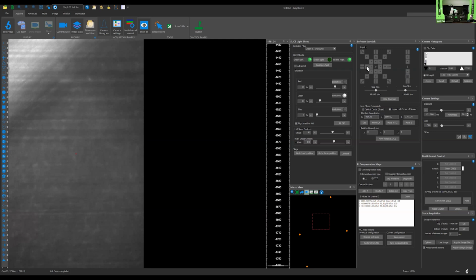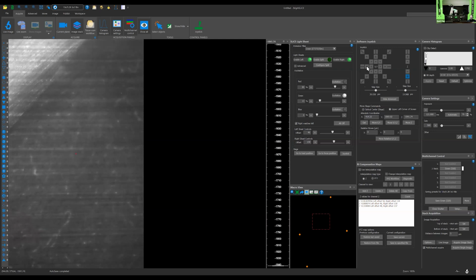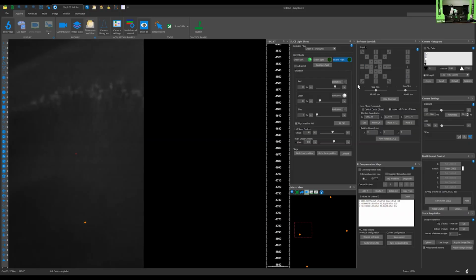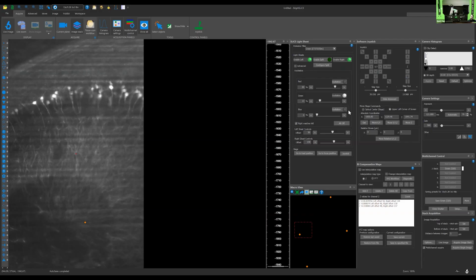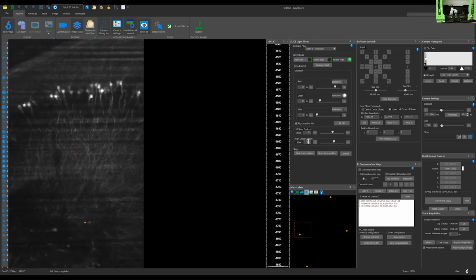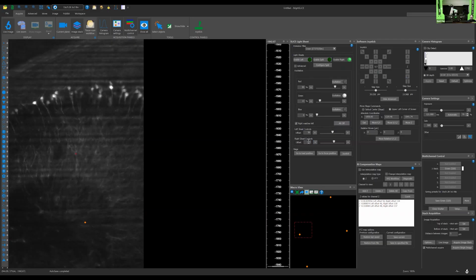And what we can then do is repeat that process we performed before. So I'm going to turn off my light sheet. I'm going to adjust my left light sheet here. And you can see the left light sheet as we go deeper and deeper into this mouse brain. We're actually on the side of the mouse brain that's closer to the right illumination, so it makes sense. That's actually a good example of why we have these dual-sided light sheets.